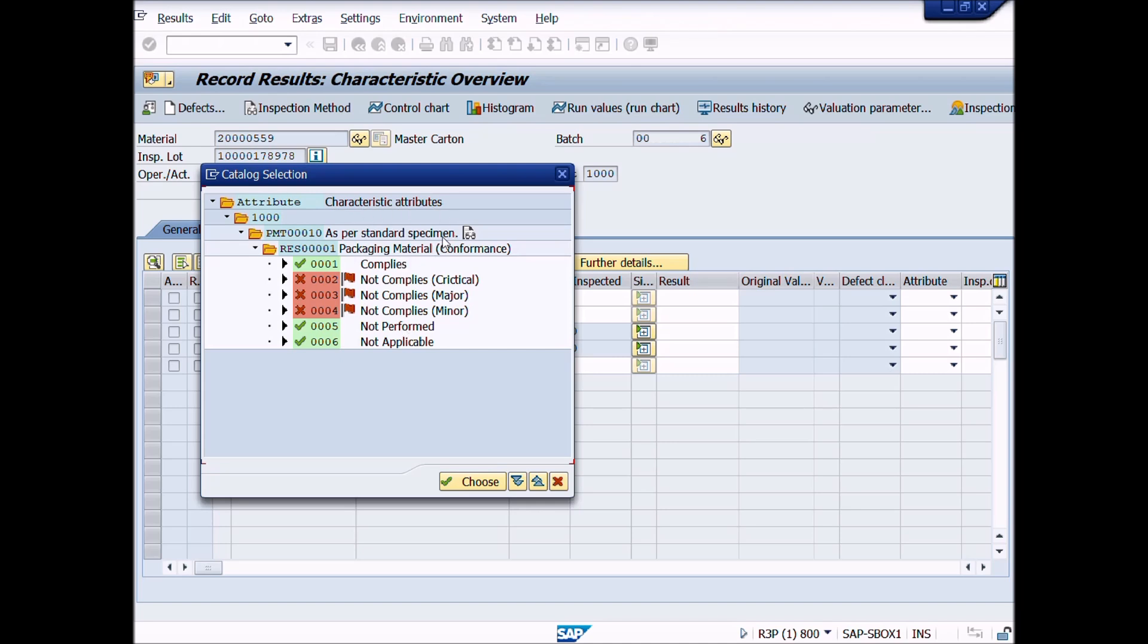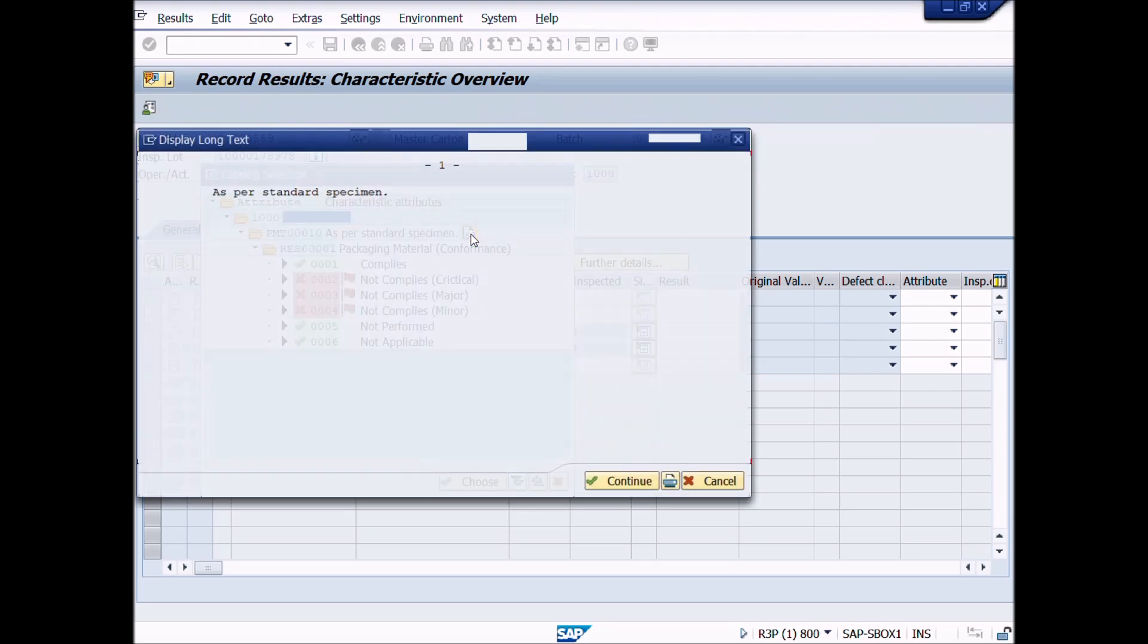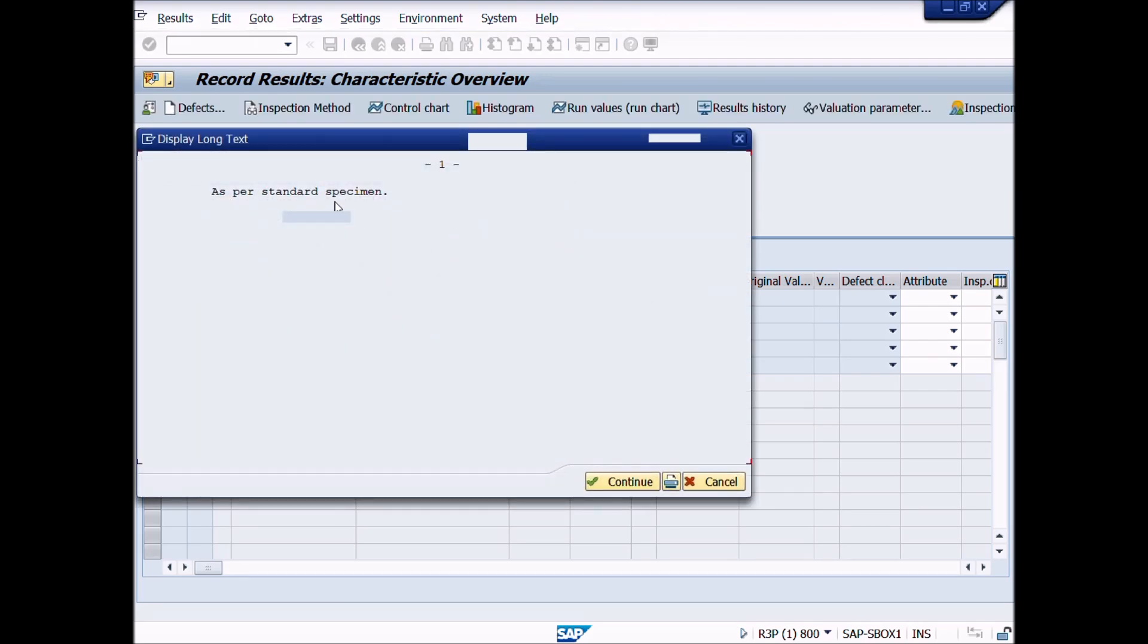In previous lectures, we have learnt how to create characteristic attributes, selected sets, codes and code group etc. Here you can see selected set or specification of this test, i.e. as per standard specimen. If text is longer than 40 characters, you can read full description by pressing display long text button, like this.